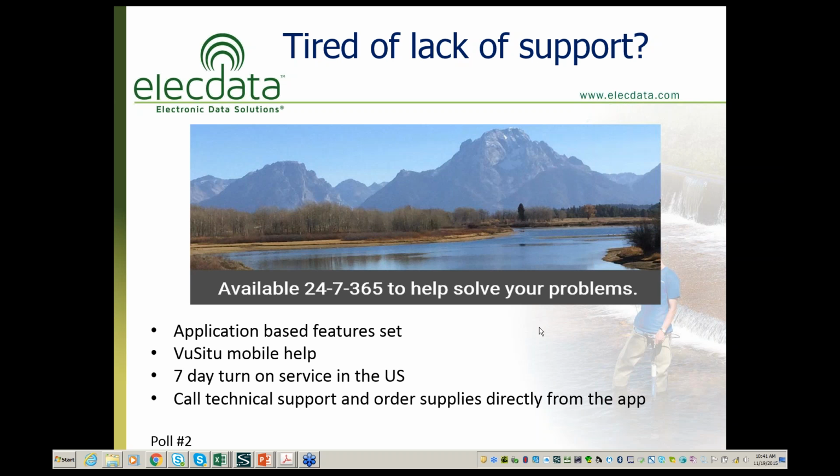we're going to let you weigh in: if you could choose one additional sensor for the AquaTroll 600, in addition to the sensor suite that it already includes, what would that selection be? So I provided what I thought were 5 of the most common ones right there. These would include chlorophyll, total dissolved gas, nitrate, ammonium, or chloride. So if you had to choose one of those 5 for another sensor for this thing to support, what would that be?